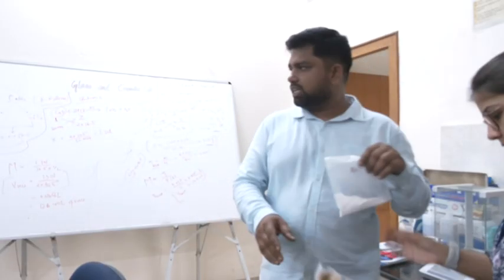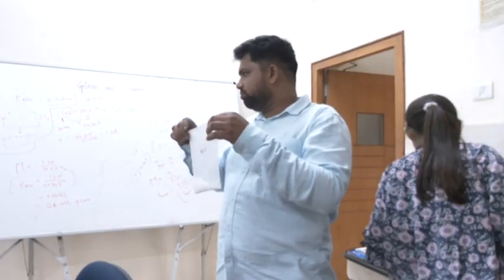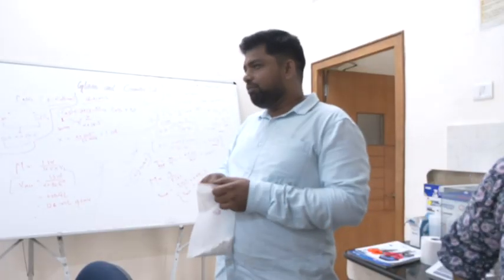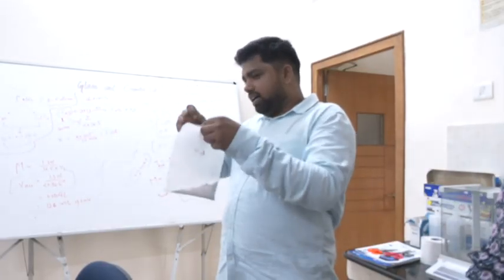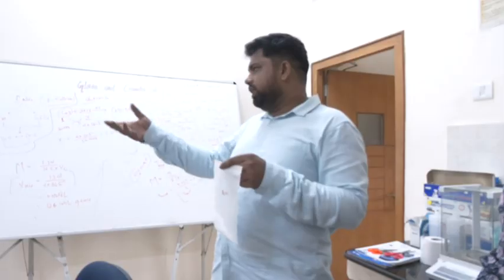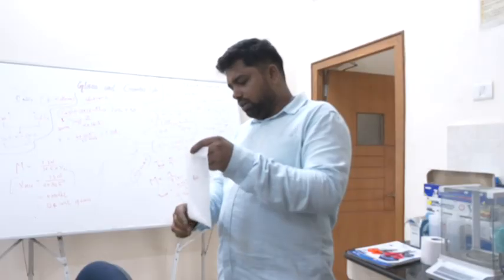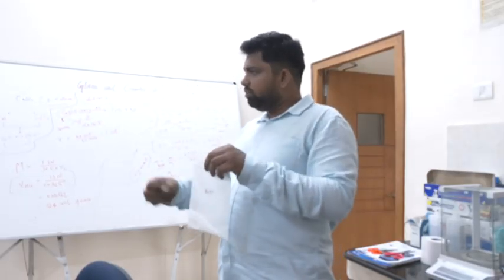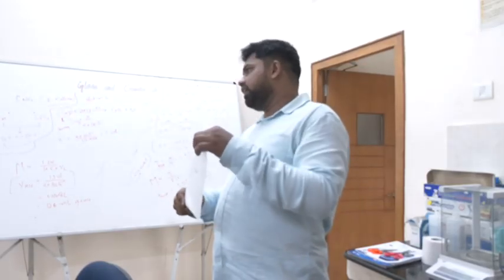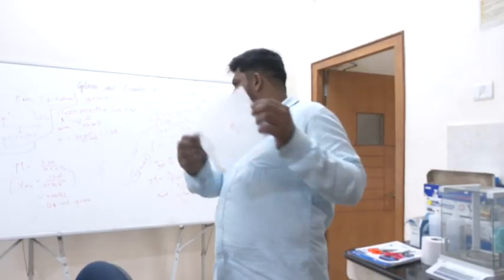Similarly, for eggshell, you have all eaten eggs at home. Okay, eggs you have eaten at home, and you are vegetarian. You have seen on TV that when they break the egg, there is some organic film inside. So we take the eggshells and remove those organic films. Then we wash it, and grind it in a pestle and mortar to a fine powder. Then we do calcination at 900 degrees Celsius, so we get this beautiful white powder. That we can use for our process.